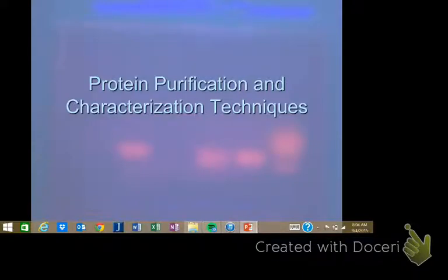All right. So let's say that you want to do research on a specific protein, or you need to get a specific protein out of a cell. There are thousands upon thousands of different proteins in a single cell, and so you have to be able to purify it. Even if you have it overexpressed, where you've cloned it into, say, E. coli or yeast or SF9 cells or something like that, you still have to purify it to get it away from all the other proteins, and also to get rid of all the other cellular debris and everything.